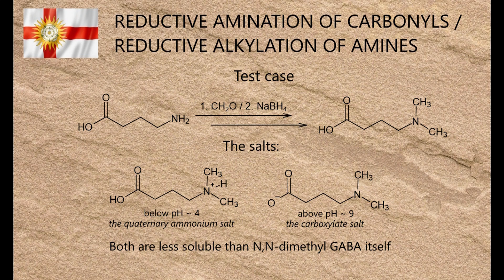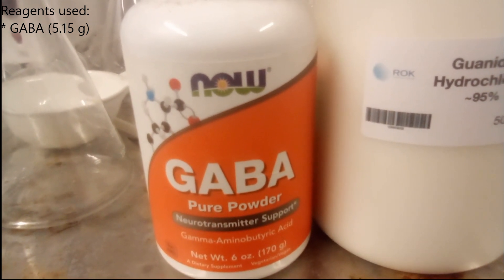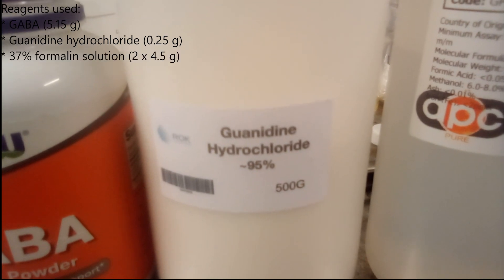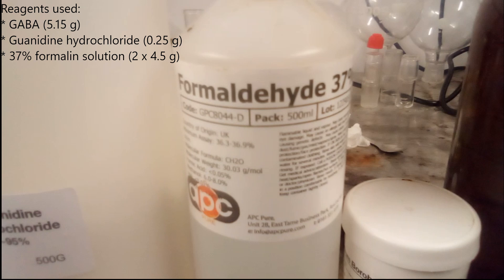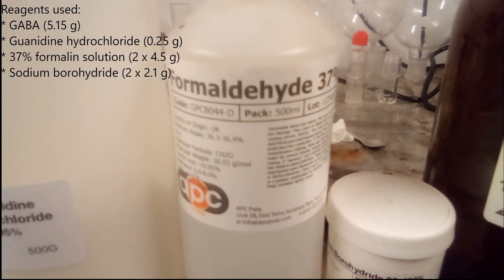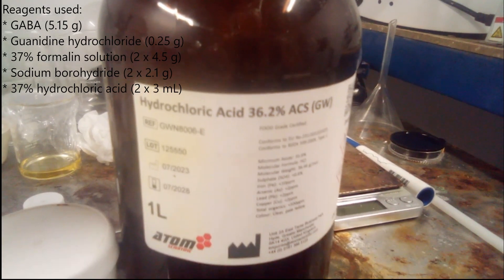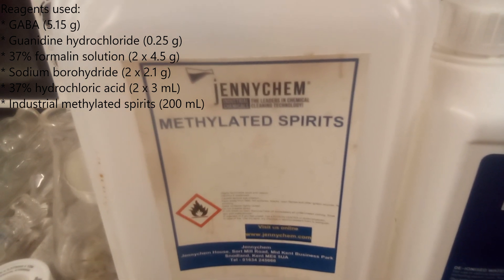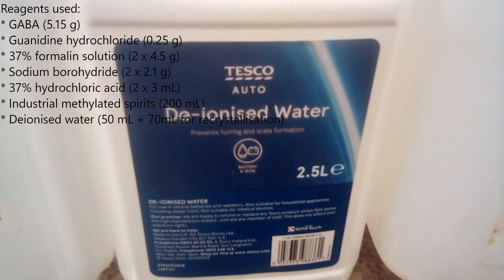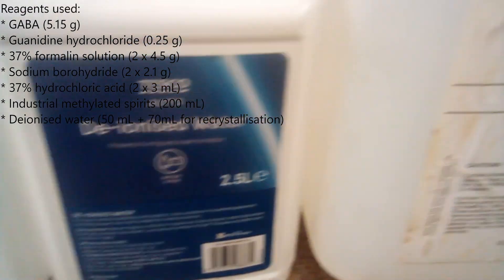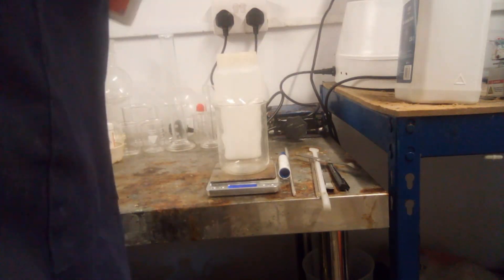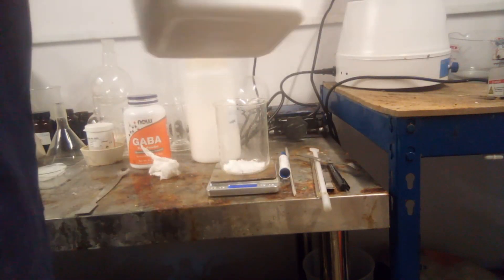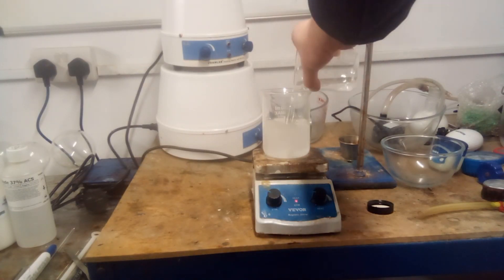The reagents used: GABA, 5.15g; guanidine hydrochloride, 0.25g; 37% formalin solution, 9g divided into equal portions; sodium borohydride, 4.2g divided into equal portions; 37% hydrochloric acid, 6ml divided into equal portions; industrial methylated spirits, 200ml; deionized water, 120ml in portions of 50 and 70ml; and acetone. Guanidine hydrochloride and GABA were dissolved in 50ml of water, then 200ml of methylated spirits were added to the mixture, followed by the first portion of formalin.